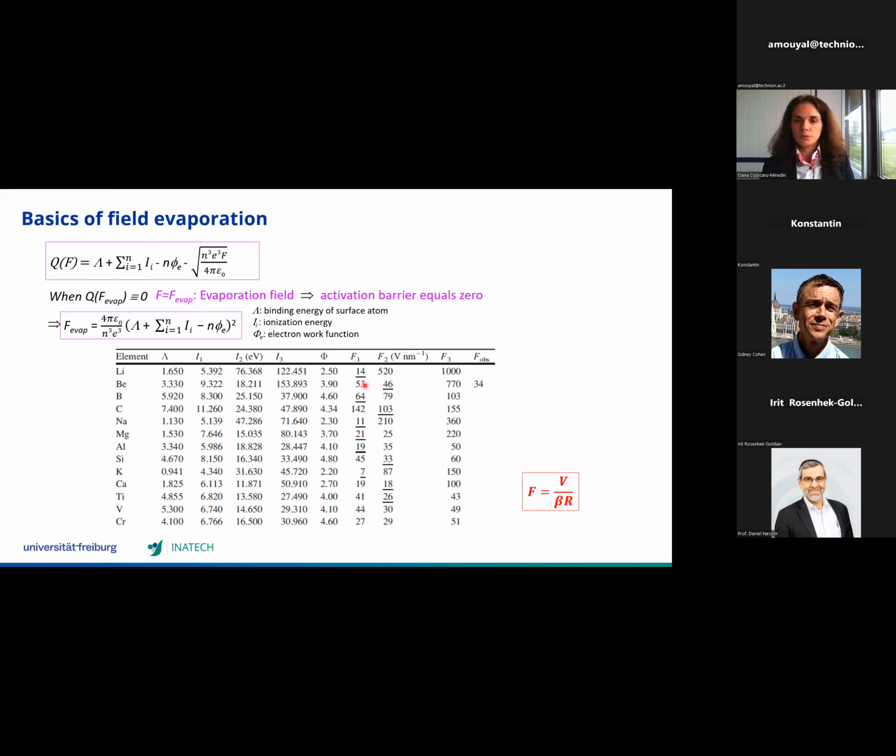The difference between the single charge ion and the double charge ion is not that much, so we most probably see both charge ions in the mass spectrum, and the one which prevails would even be the double charge ion. So we know exactly from the theory what we should expect from the mass spectra, and in which proportion.